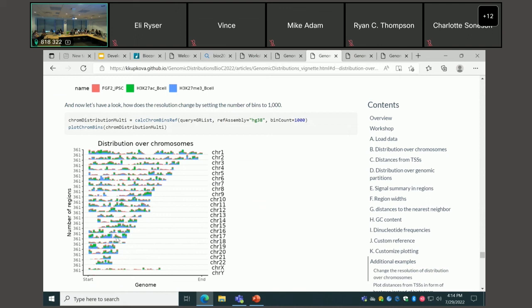At this point, we do have the function that is showing the observed versus expected frequency. Okay. But that's just looking at the sizes. At this point, we do not offer anything like this. Yeah. Okay. But I think that the idea is kind of similar.